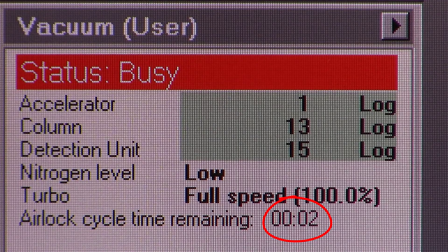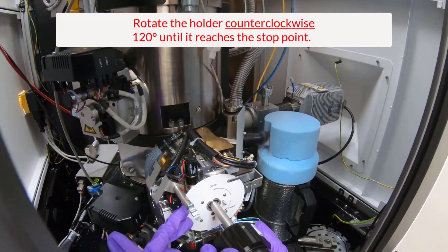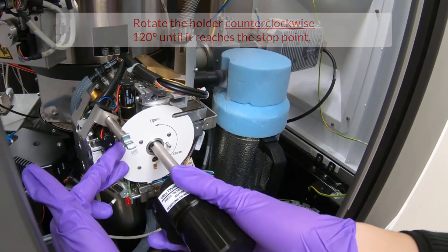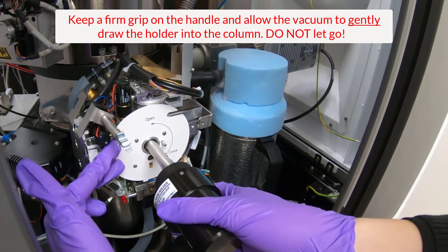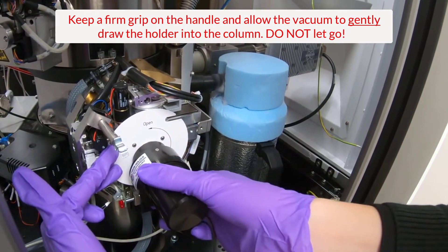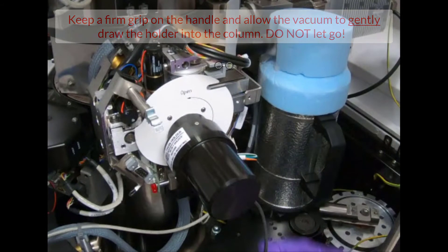Use a firm and steady grip on the black knob. Rotate the holder counter-clockwise 120 degrees until it reaches the stop point. Keep a firm and steady grip on the handle. Let the vacuum gently draw the holder into the column in a controlled manner until it reaches the stop point.